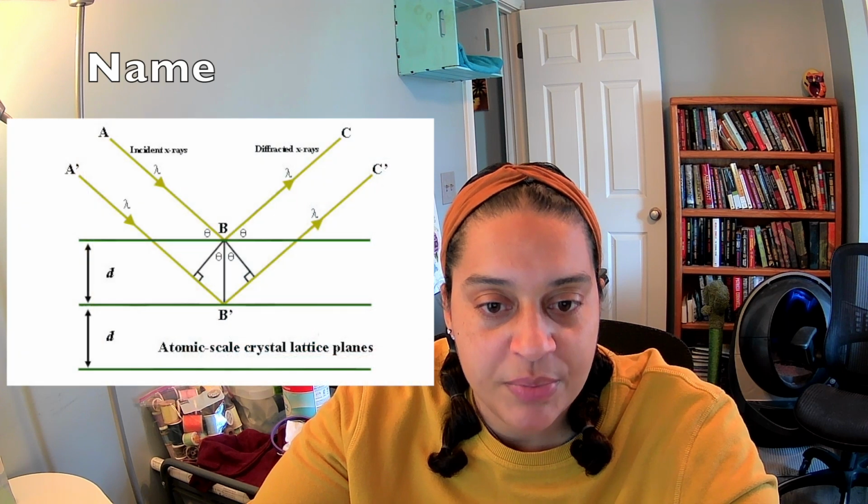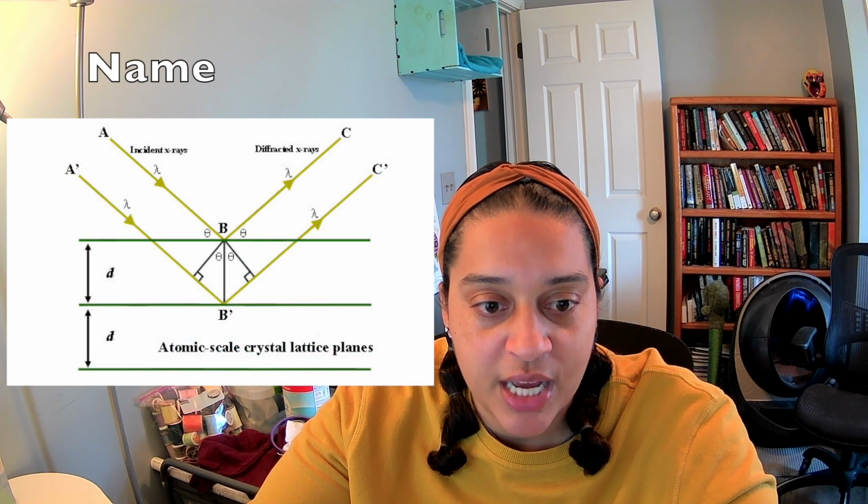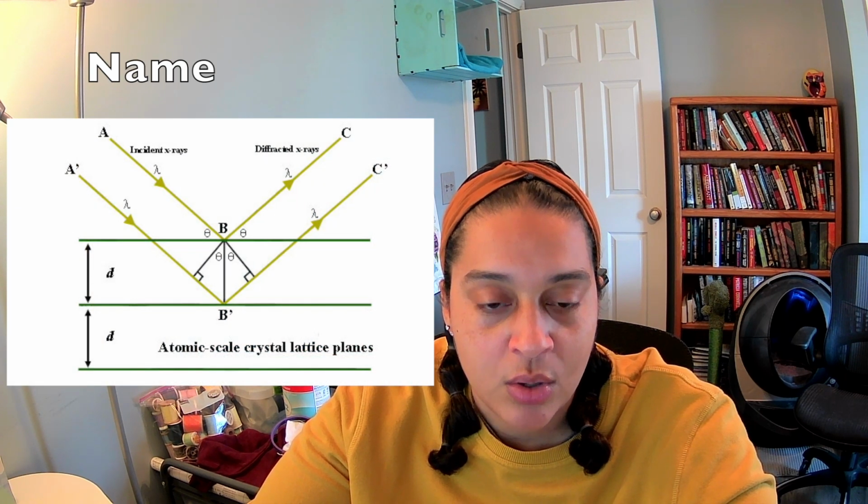The last technique in Category A is X-ray diffractometry. This technique can determine a sample's atomic composition or crystalline structure. X-ray beams are sent through a sample, and the diffraction angle, or the beam's change in direction or angle when it passes through the sample, is determined.